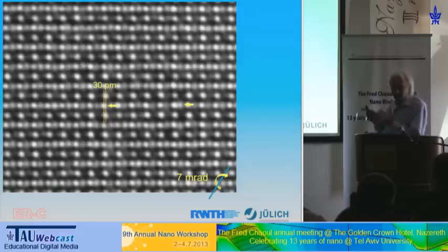And the reason behind this is specimen tilt. The mechanical adjustment possibilities you have in such a modern optical instrument are still Stone Age, or Metal Age, let's say it like this.